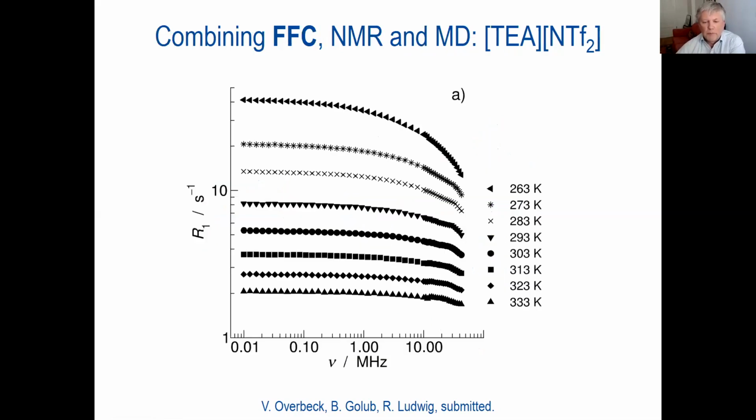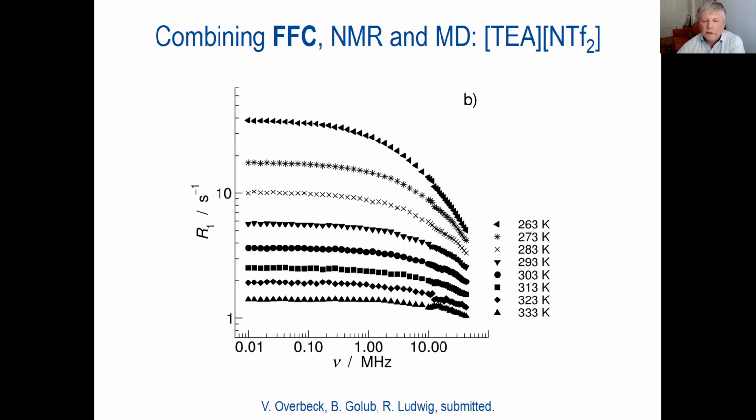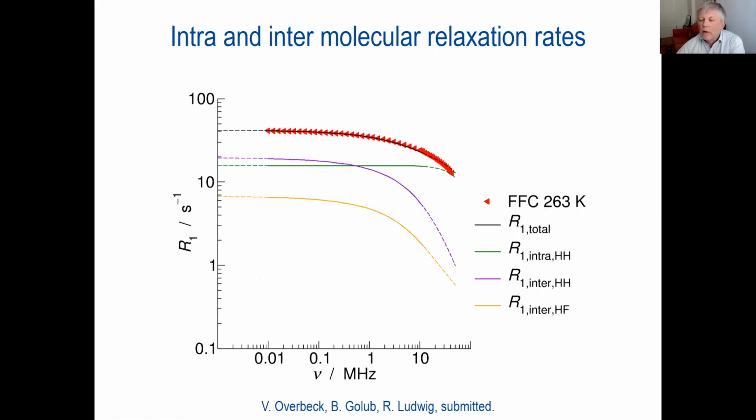And we would like to do that step by step. So that is the well-known dispersion curves you get for the protons and for 19F here, for example. We tried to evaluate everything as we usually do, by using the Bloembergen-Purcell-Pound approach. So we did that for both nuclei, and we could dissect the total relaxation rates, as nicely published and written by Krug, Rösler, and others. So it's in a similar fashion here.